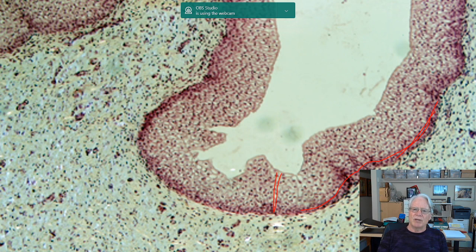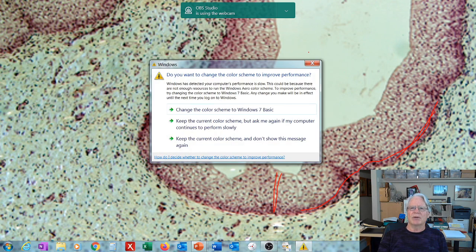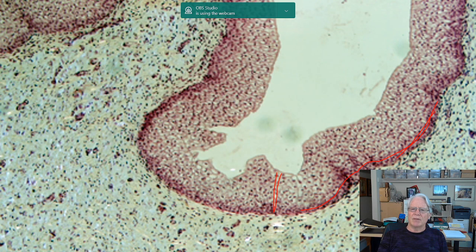No, because the pattern of nuclei is different than what we saw in stratified squamous. First of all, by the time you get to the outer surface of stratified squamous, you're not going to have any nuclei. They're going to be gone because these are dead cells. And we get instead a lack of nuclei at the outer edge. But here, the nuclei are found from top to bottom. More densely packed here, but still present in the upper area.